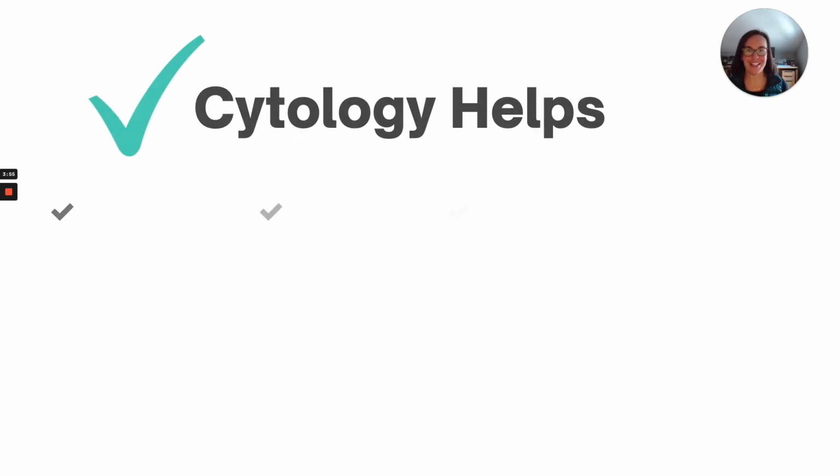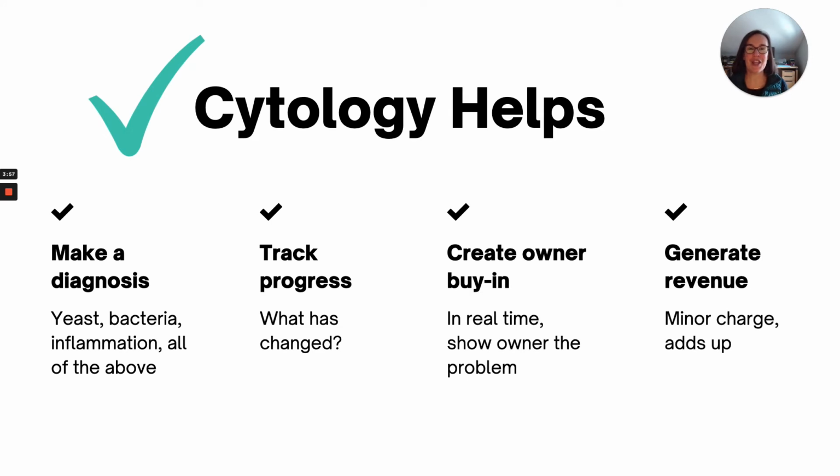Anyway, why cytology? Why are we doing this? Well, it really helps make a diagnosis. We want to make sure that we're not smelling our patients to make a diagnosis, and that we're not just looking at our patients to make a diagnosis. Sure, we're going to do all of those things as part of our general exam.